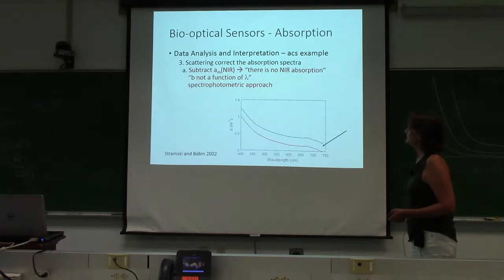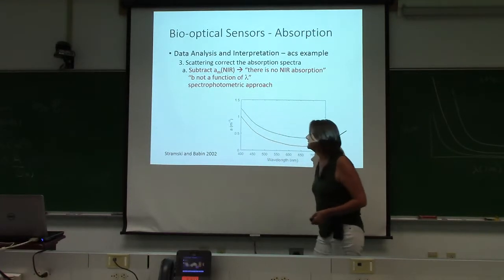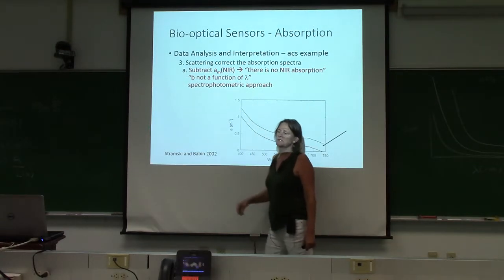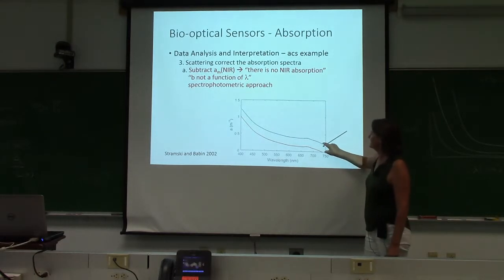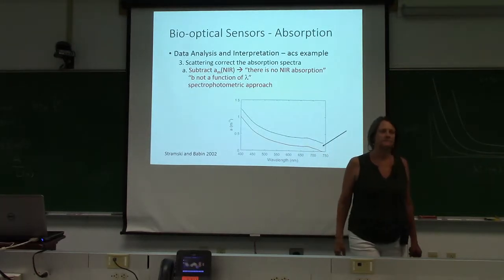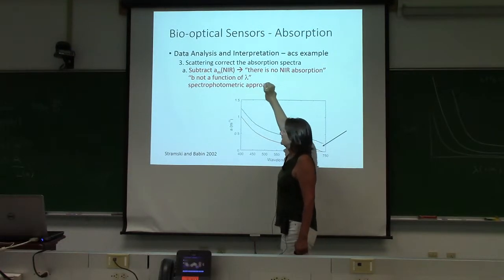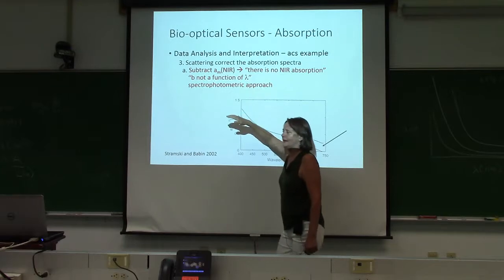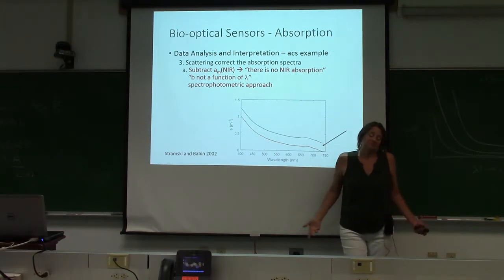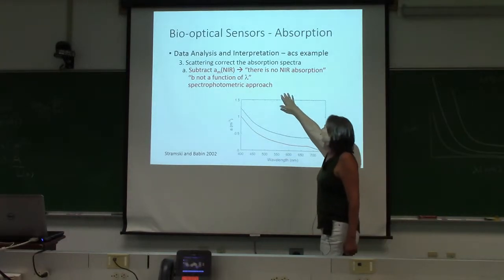So, here are some strategies. Fifteen years ago, Darius and Marcel said, subtract it. There's no signal out there. We're just going to take that value and subtract it all the way across the board, just move everything down. Okay, it's the best we can do. So that says that there's no infrared absorption. It also says that the scattering is not a function of wavelength, because what we've done is subtracted spectrally flat scattering. Maybe. Okay. So this is what you might do in a spectrophotometer in transmission mode.